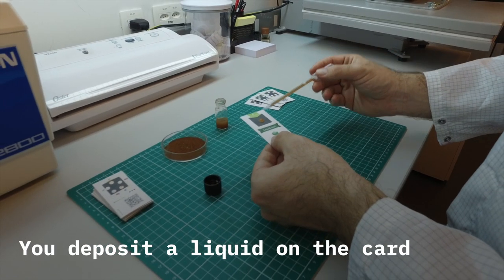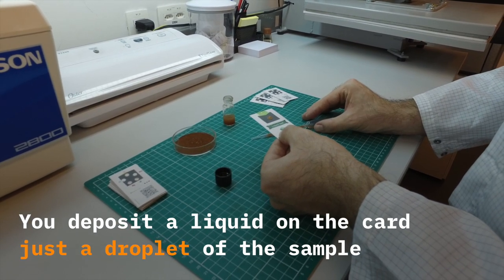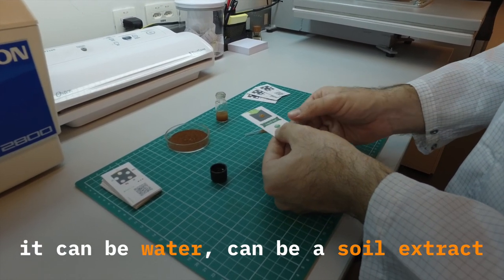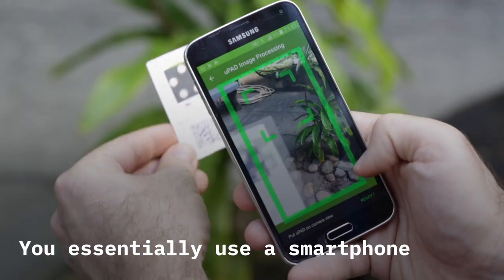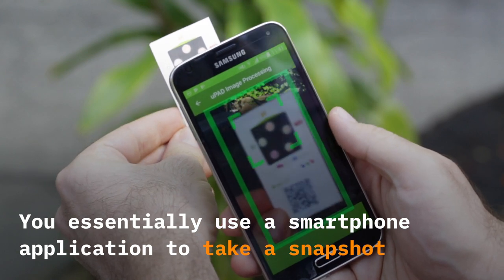You deposit a liquid on the card, just a droplet of the sample. It can be water, it can be a soil extract, and then you flip the card around. You use a smartphone application to take a snapshot.